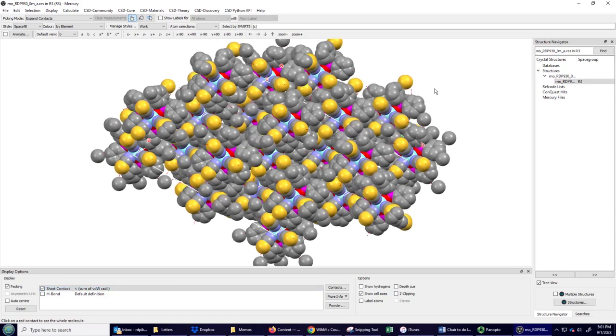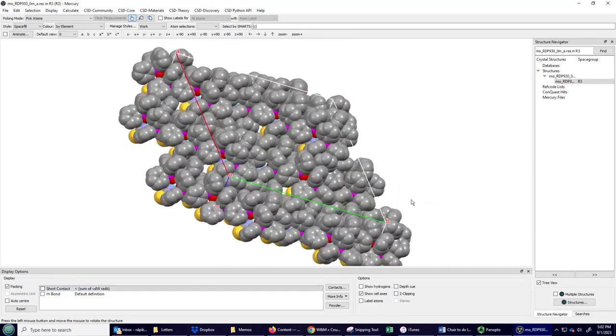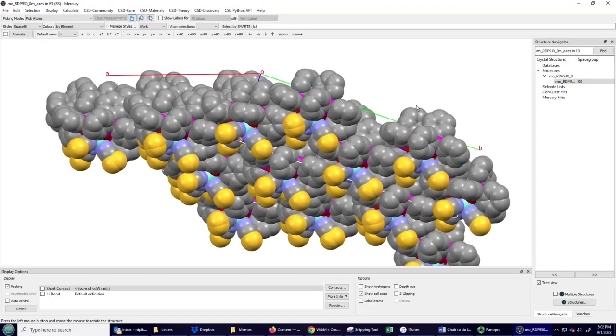And maybe there. There we go. Nature certainly does not like a vacuum, and will do her very best to fill all of the unoccupied space. You can also see something rather beautiful here with these space filling models.